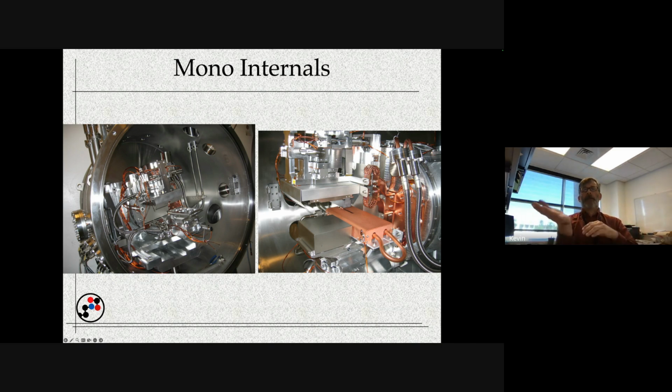So the X-rays will come in, refract up, hit the second crystal, and then go down. The second crystal really just exists to steer the X-ray beam back down the beam line. So you'll get a little bit of an offset: the incoming X-rays will be at some level, and the outgoing X-rays will be slightly higher or lower, depending on the orientation of the two crystals.